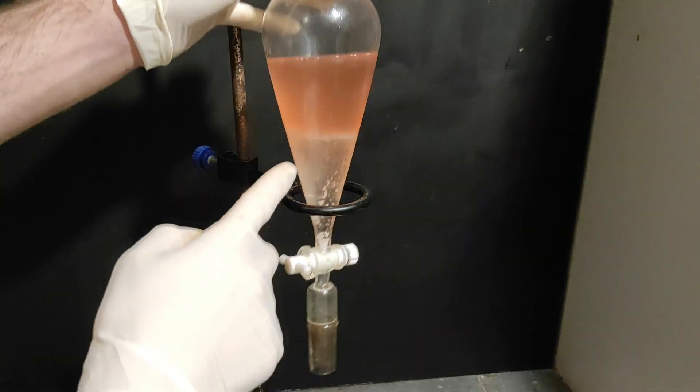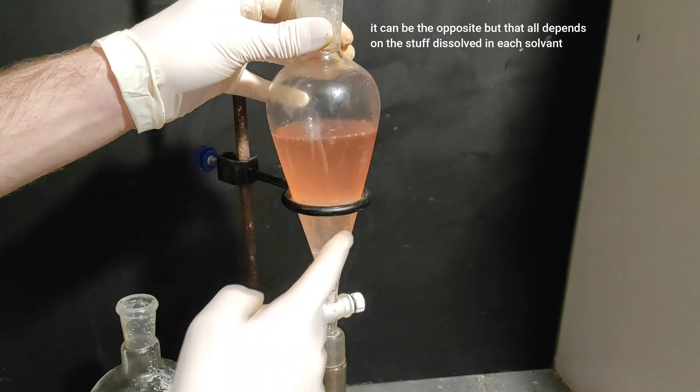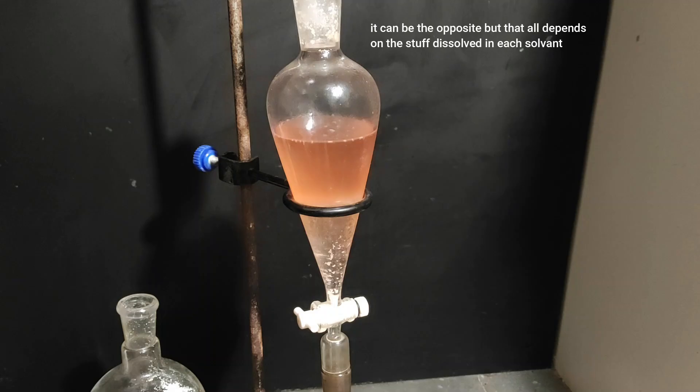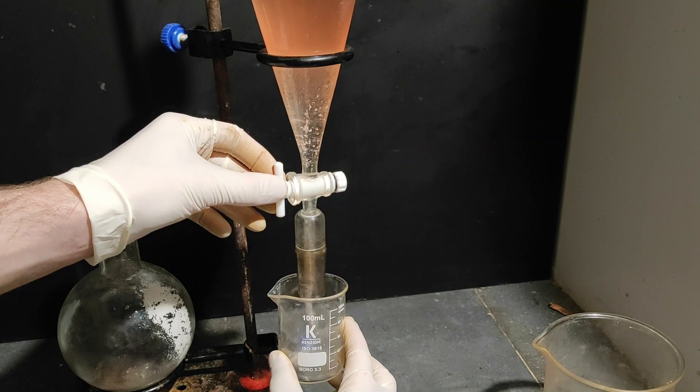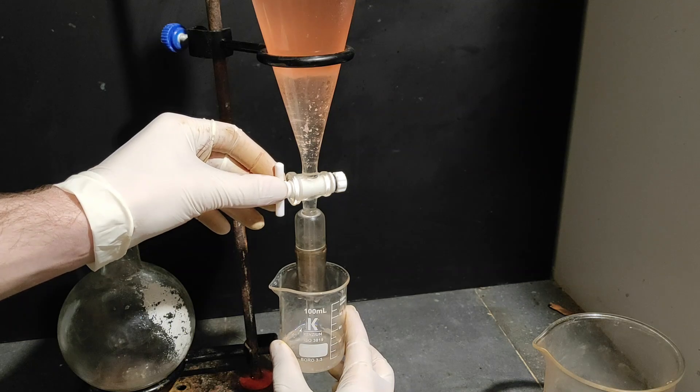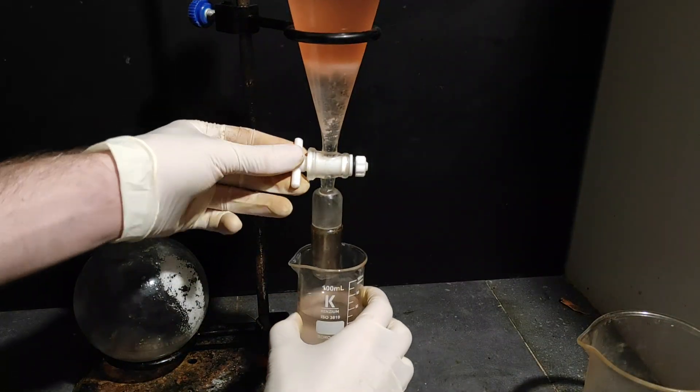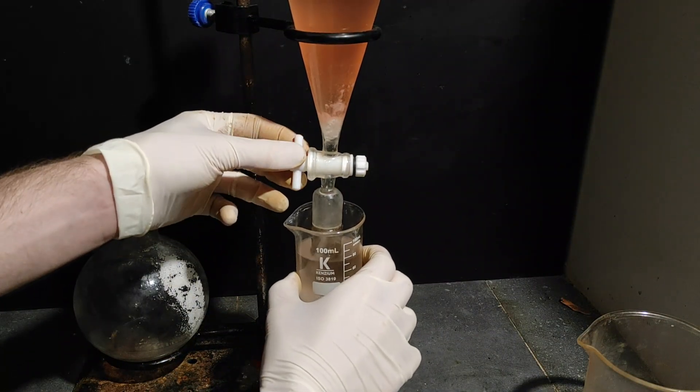For me the bottom layer was the organic one which seems very weird but if it works don't question it I guess. I repeated this process a second time to obtain almost 70 milliliters of a solution of dichloromethane and our methyl salicylate. By this point the whole lab started to smell like it which was pretty cool.